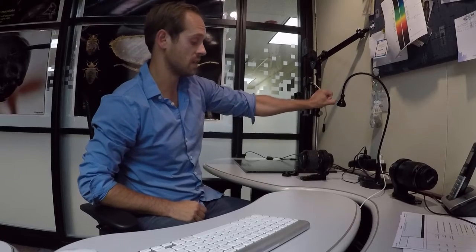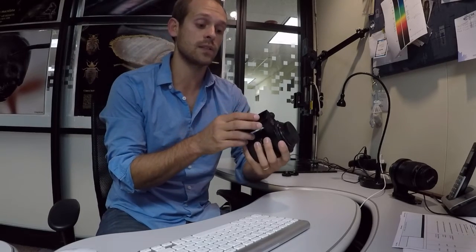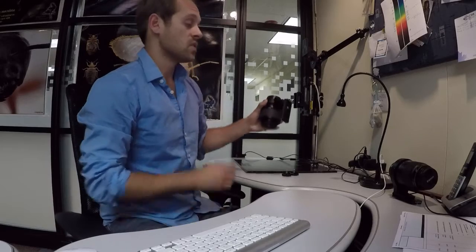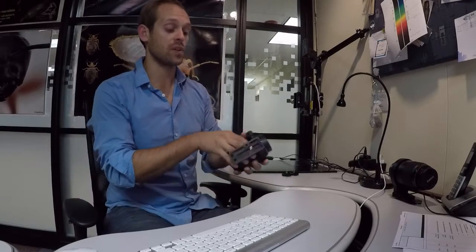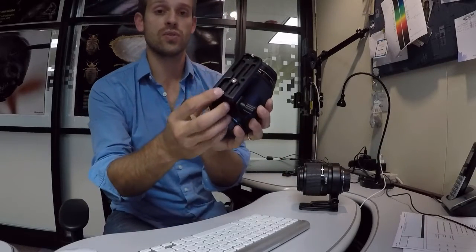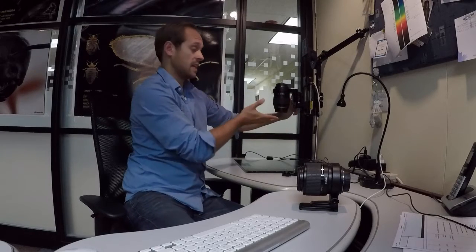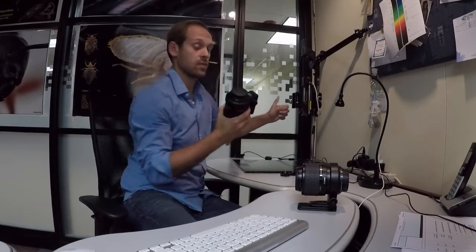There are two screws that fit into the bottom of this adapter bracket. In vertical orientation, if the lens starts sliding it'll catch loosely — it's an added safety mechanism. If you're not confident about grabbing it, make sure those two screws are in there. For example, if I unloosen it and forget to grab it, it'll slide down and catch. Without the screws, you lose that safety.